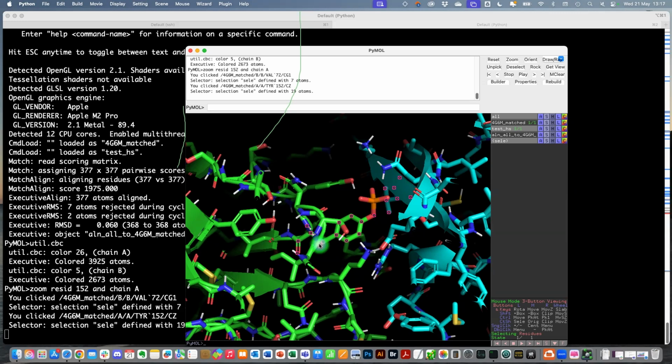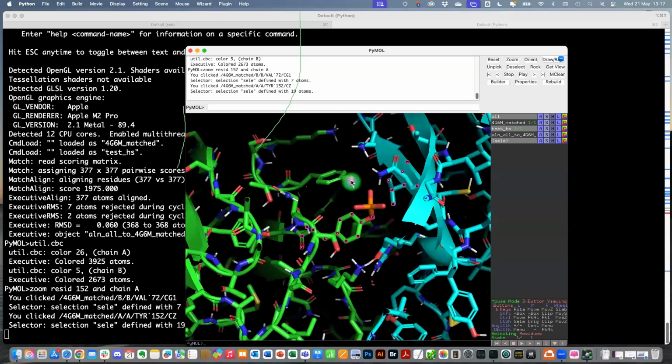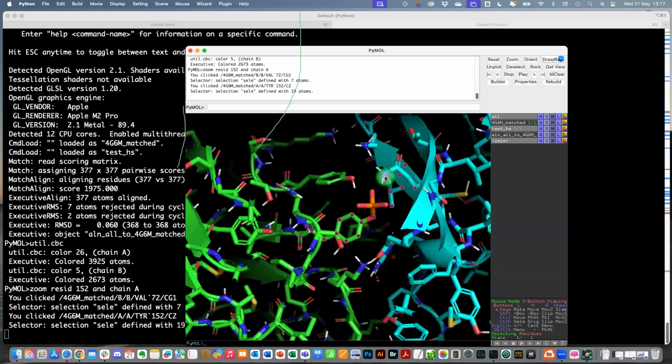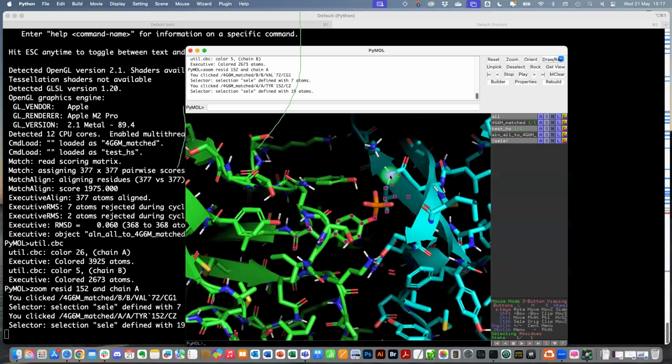You know, it doesn't look crazy. So there is a hydrogen bond with another tyrosine here. There is a lysine here. This is an asparagine, I guess. So it put it somewhere that makes sense. We didn't introduce clashes. The score is better.